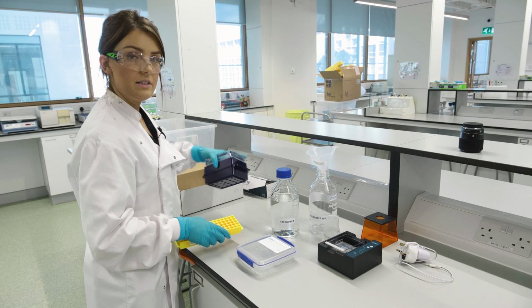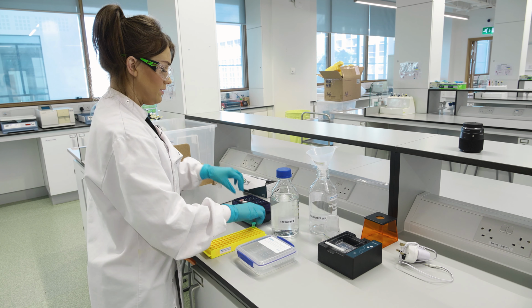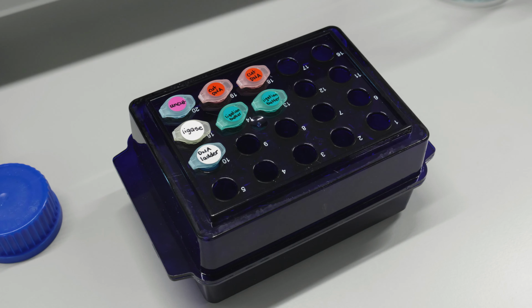When the students are using their DNA samples, you can give them the microtube racks and they can use each of them in it. And the DNA ladder will be provided as well.